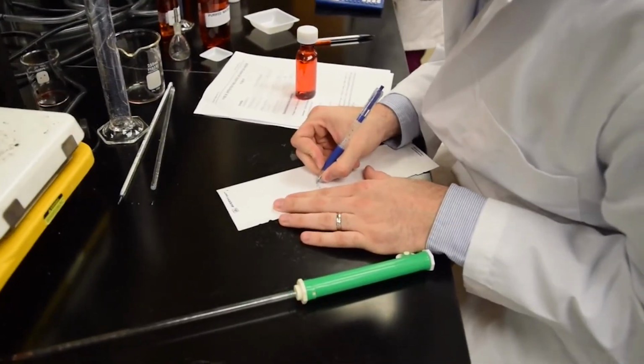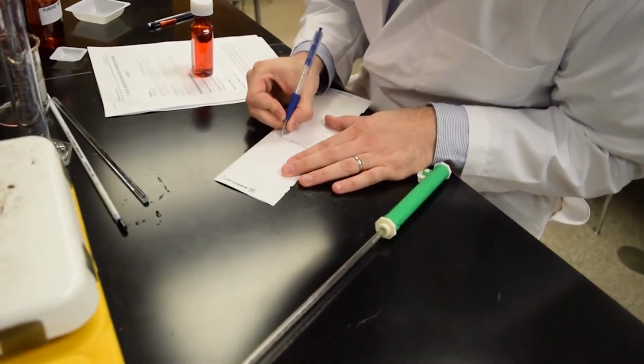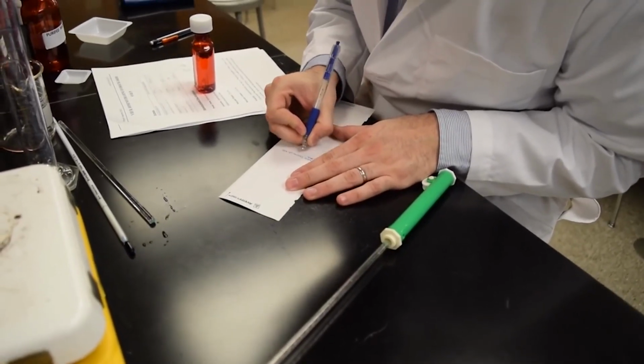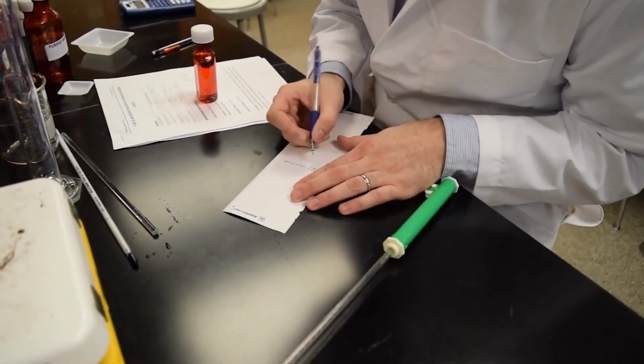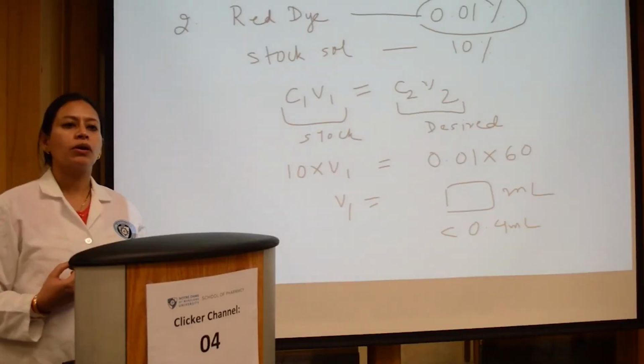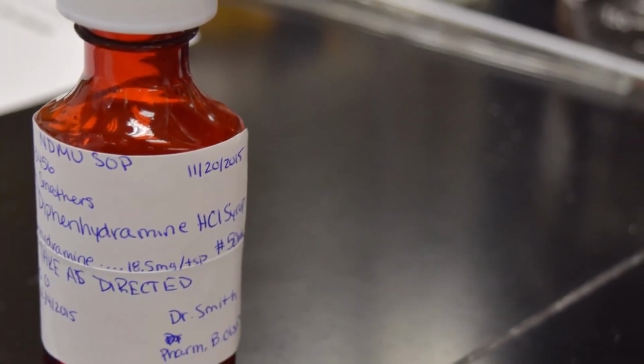So what are the things that will be on the label? You will have the patient name, the physician's name, the date, the name of the product, the quantity in which you are dispensing the product, and report the concentration of the drug in milligrams per teaspoon. Okay? Any auxiliary information that is required? Yes.